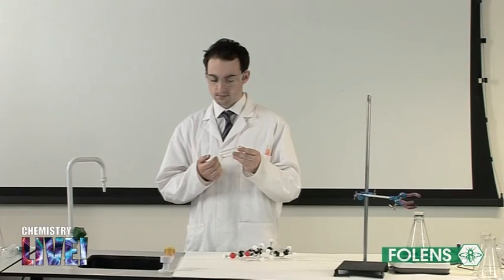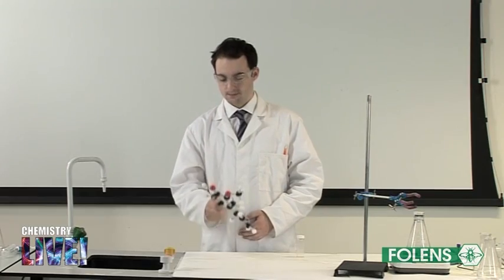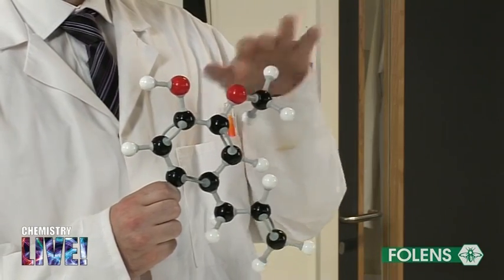This oily substance is the oil of cloves, which contains mainly eugenol as the essential ingredient, but some other oils are also present. The structure of eugenol is shown on the screen. This is what a molecular model of eugenol looks like. Note that there are 3 substituents on the benzene ring.